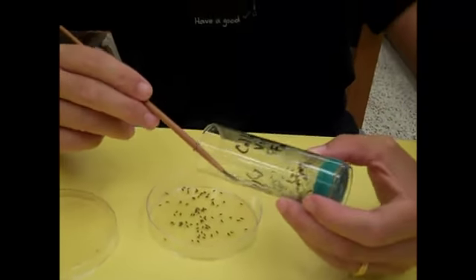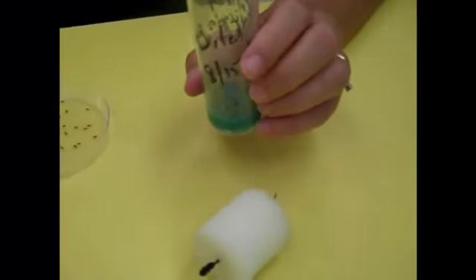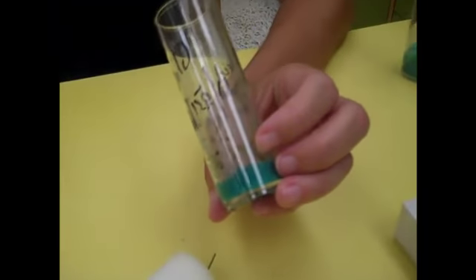Now, I really, really want to get all of these adult flies out of here, and the reason I do is because what we are going to need to do all of our experiments are virgin females, and we talked about that in the PowerPoint. You need females that have never mated before, so that they aren't storing sperm, so that way we have control of who mates with them. So I think I've got all the adults out of here.